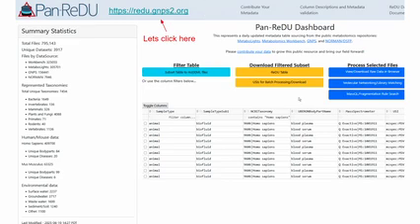The way you can think about this is basically all the metadata that we have been able to aggregate across all the public repositories that are out there. On the side, you see some summary statistics on the number of files and the number of different sample types that we have available right now. Most importantly, you also see, not on my screen but on yours if you have opened it, a download button where you can just download the whole thing and work with it locally.